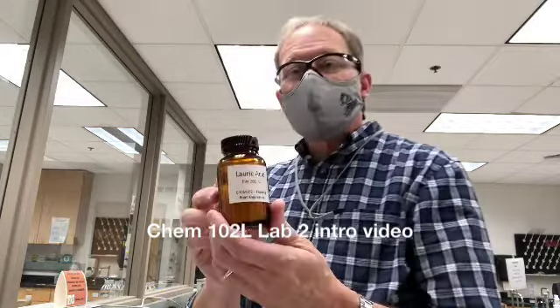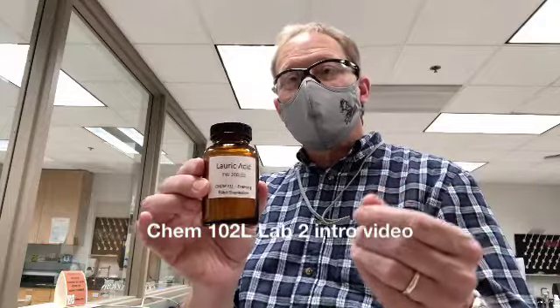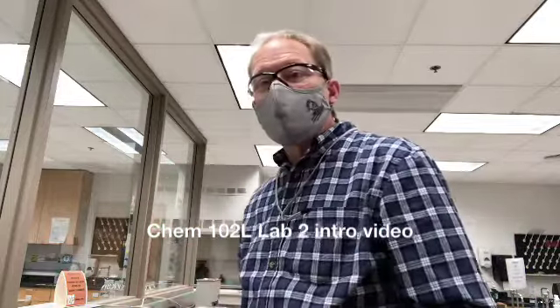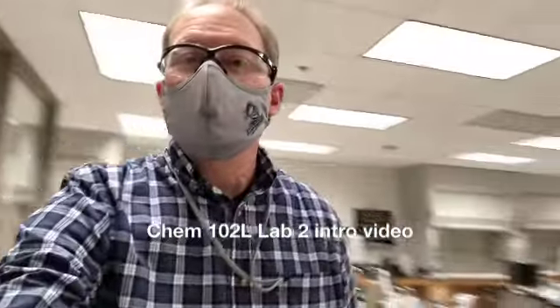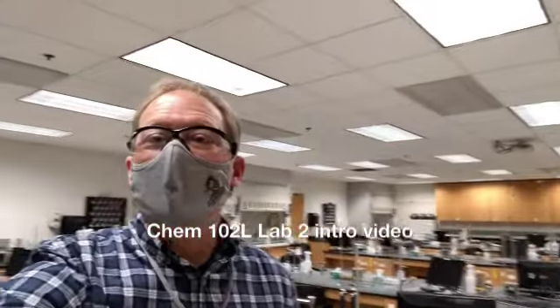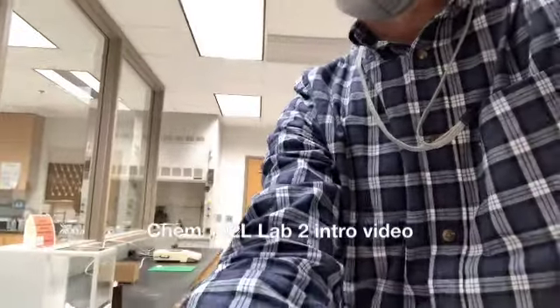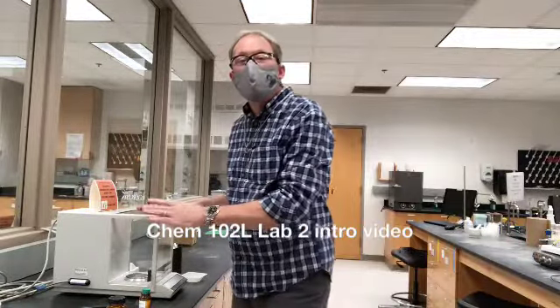One of the challenges here is to work with the masses of these so you can accurately make a solution. And so I'm going to talk for a little bit about how to use these mass balances, and that's why I'm here in the laboratory. You can see this is our Gen Chem lab, and I'm set up here by all these balances that are here against the wall, against this glass divider between labs. And this balance here is called an analytical balance.